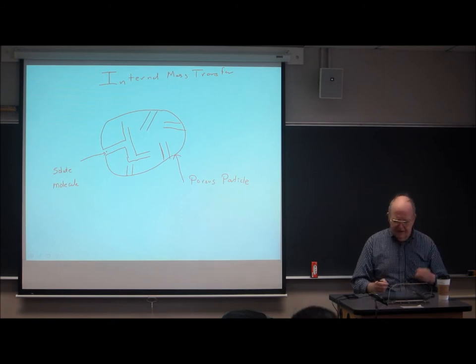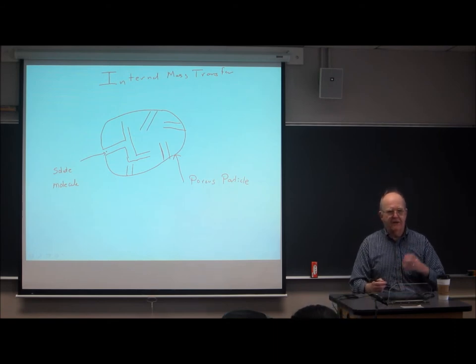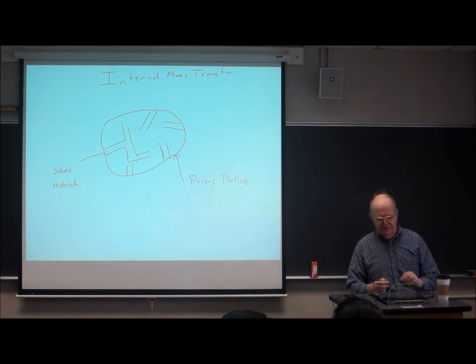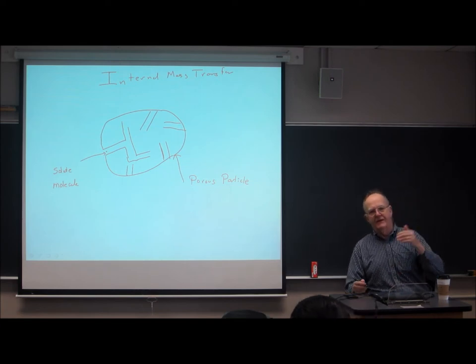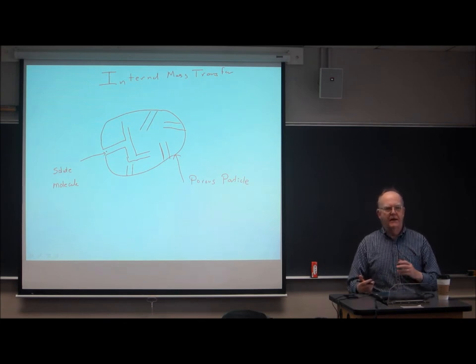Now, once the particle enters a pore of the support particle, I sometimes slip and call it the stationary phase, but that's not truly accurate. The porous particle is sometimes only just an inner carrier of the stationary phase. It per se doesn't cause retention. The stationary phase may be coated inside the porous particle. But once the solute enters the pores of the particle, that's now no longer external mass transfer, that's internal mass transfer. There is no convection in the pores in 99.99% of chromatography. There's no convection in the pore. The only way this stuff can move around in the pore is by diffusion.